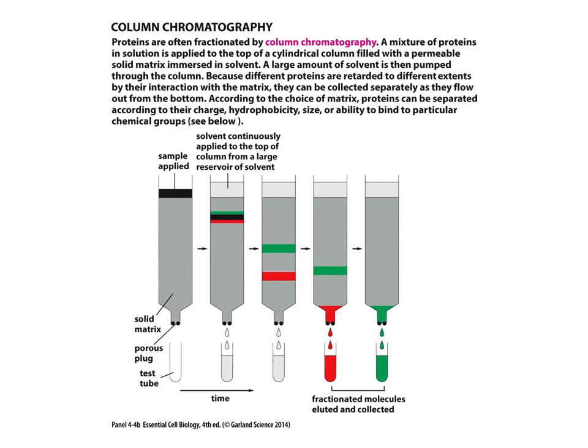Okay, so depending upon what, again, the matrix is, kind of changes how the technique is done, what material is going to come off when. Okay, but again, the idea is that we have this mosaic of proteins that are present that we're putting over on this column through the sample, but we're able to actually isolate the different ones. We then could use these different fractions to do additional tests, like a Western blot, like an ELISA.